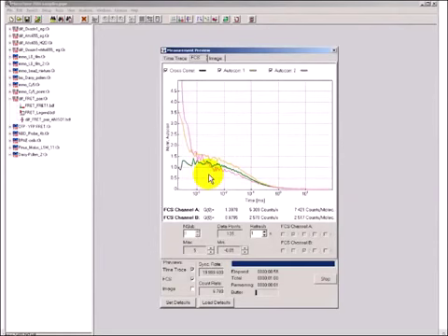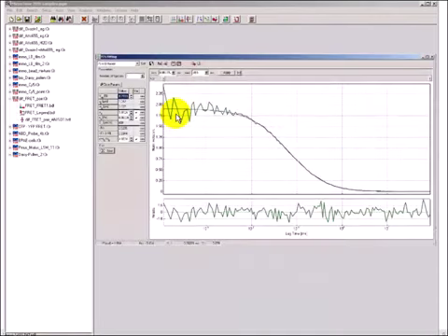During the measurement, the autocorrelation and cross-correlation curves are calculated and displayed. The green curve is the cross-correlation, the correlation between two detection channels. After finishing the measurement, the curves can be analyzed. By fitting the curve, parameters like diffusion time, diffusion coefficient, and sample concentration are determined.